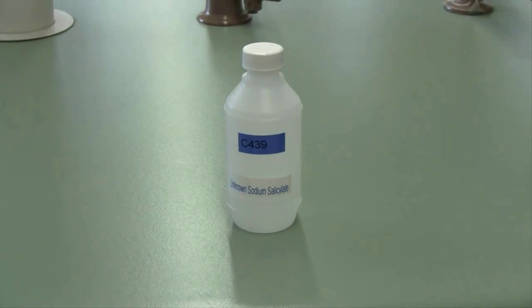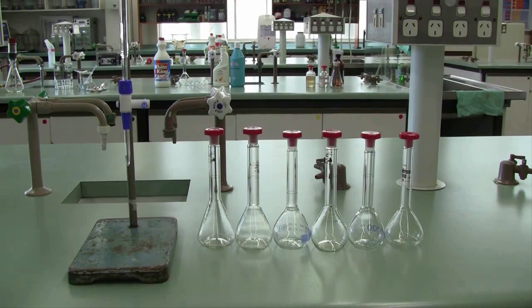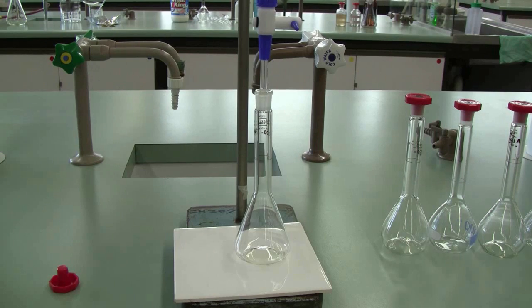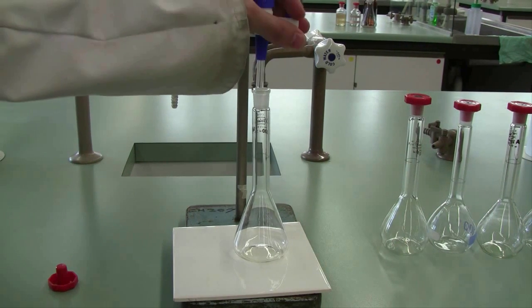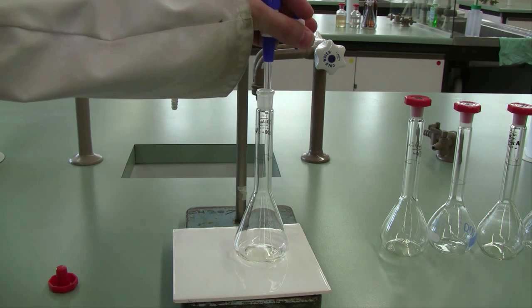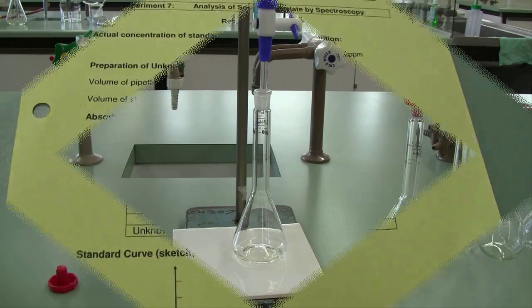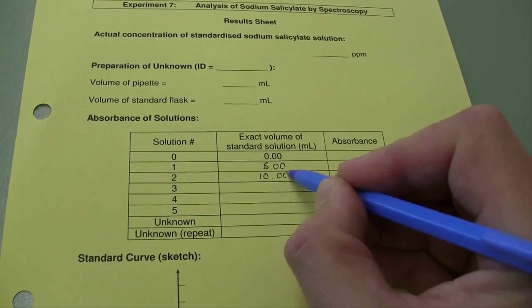You'll be issued with an unknown sample and an array of 100 mL standard flasks. Take the 150 parts per million standard sodium salicylate solution provided, fill your burette with it, and then use it to deliver an array of precisely known volumes into each standard flask according to the table in your notes. Record the exact volume you deliver on your results sheet.